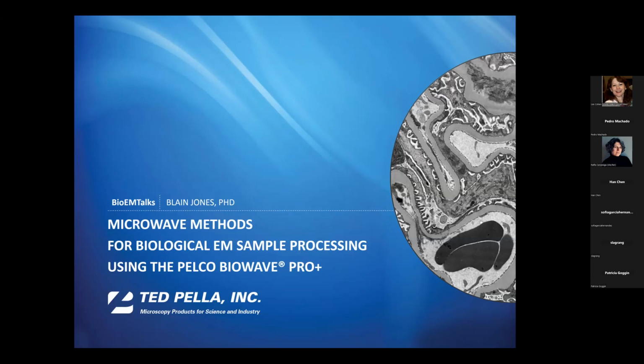So my name's Blain Jones. I got my PhD from The Ohio State University, and now I am a life science product specialist at Ted Pella. Today I'm going to be talking about microwave methods for biological EM sample processing, specifically utilizing Ted Pella's Pelco BioWave Pro Plus.